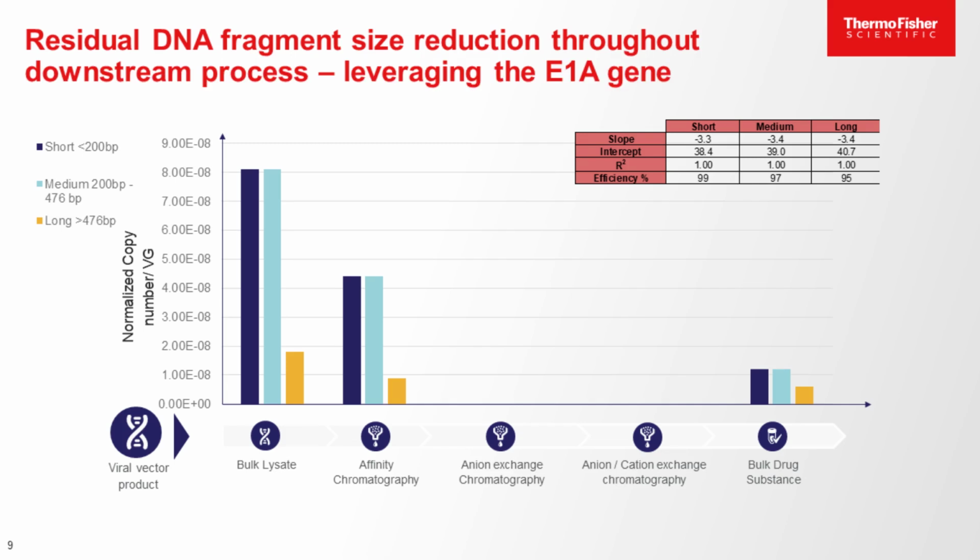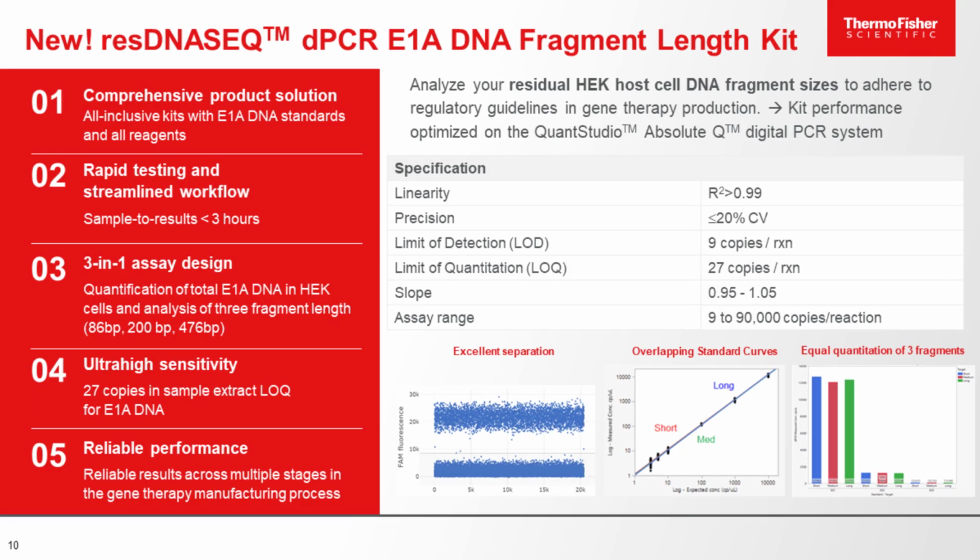You see some correlation. Here we were only testing it at the 3 points that I mentioned before. To HEK, you also see that the customer here in this sample still has some medium and some long fragments in their bulk drug substance present, which is certainly an indicator that they have to continue to further analyze what's actually in their capsids here, so that once they go in front of regulatory bodies, they really have a good understanding of the risk profile of this type of product.